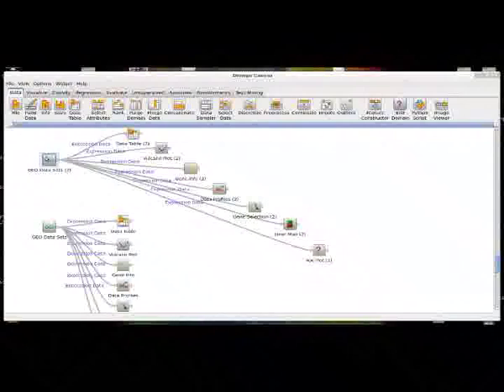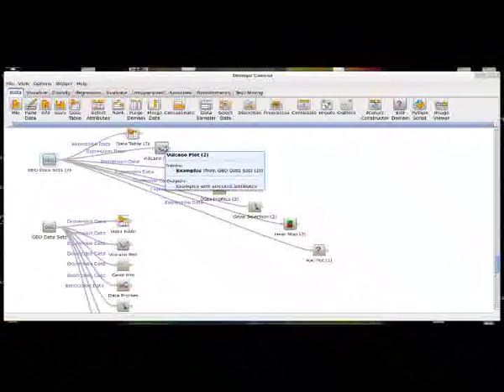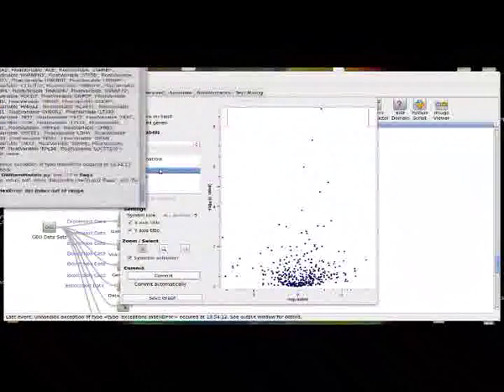GeoDatasets is one of the few places that I've found where you can literally just plug and play high-level bioinformatic data, and because we're in Orange, we already have a large amount of high-level tools to begin analyzing this data. So back up to our tissue splicing examples. Let's take a look at the volcano plot widget, which is used for determining genes of interest.